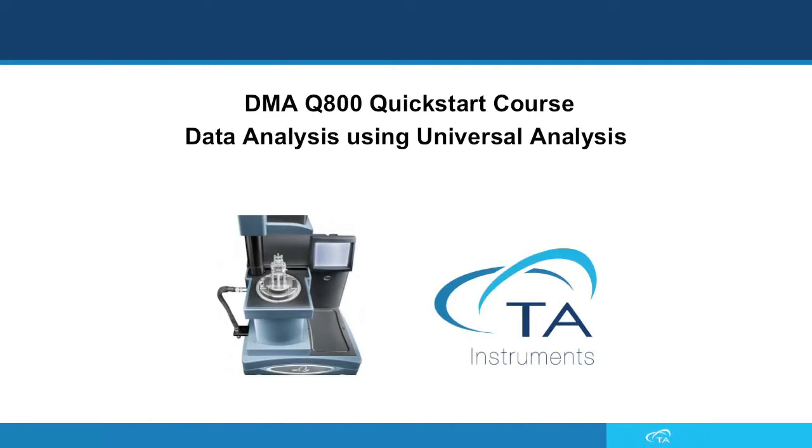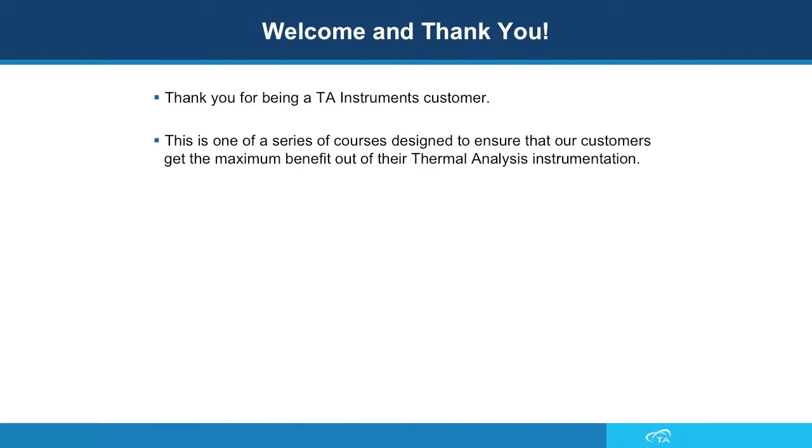This is the DMA Q800 QuickStart course that's going to cover data analysis using the Universal Analysis program.